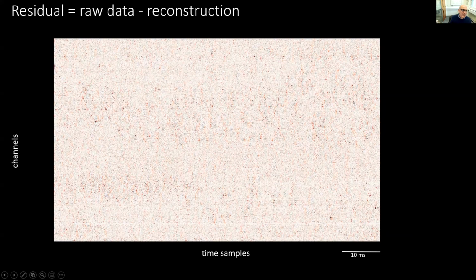There's a question that I think is relevant, which is, what version of Kilosort are you showing right now? So, good question. The answer is that this would be common to all versions of Kilosort. The way that I'm going to go through things now is Kilosort has mostly added stuff to itself over time. Few things from the past have really gone away.